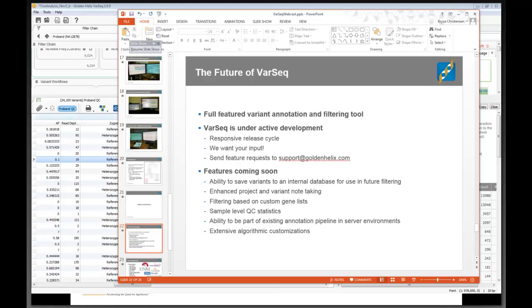Can the software upload independent VCF files together? That's a question that I might need to hold off on answering. It definitely allows you to upload multiple simultaneous VCF files that are all part of a particular workflow. But if you have 2 VCF files for the same sample, right now I don't believe that it will merge them.